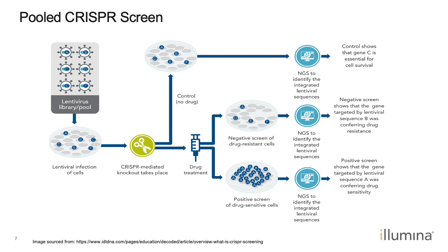All right, so now that we have a better understanding of how we make these viruses to be used in our screens, let's chat more about the screen itself now. The idea of these genome-wide CRISPR screens is to knock out every gene that could be important, but we only want to knock out one gene or target per cell. In other words, we only want one guide RNA per cell. So really, the intended result is creating a population of cells with a different gene knocked out in each one of them, again based on that unique guide RNA. And as a result, some cells will die, but others will actually survive or even grow better than before.